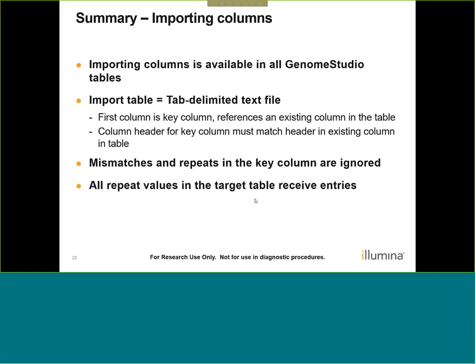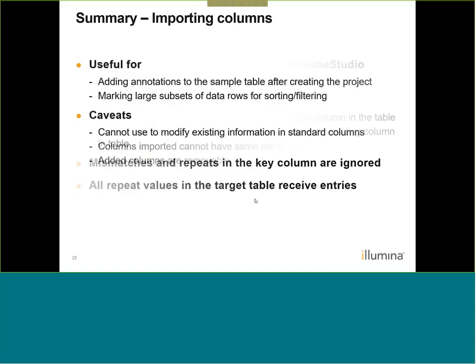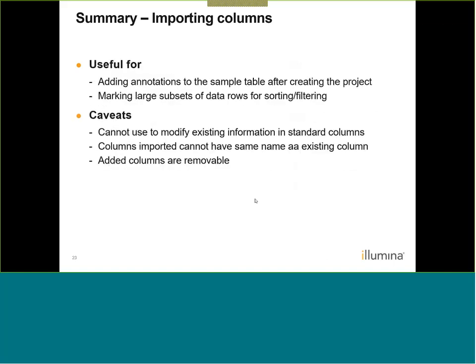Mismatches and repeats in the key column are ignored, and all repeat values in the target table will receive entries. And the column import is useful for adding annotations to the sample table after creating the project, and for marking large subsets of data rows for sorting and filtering.